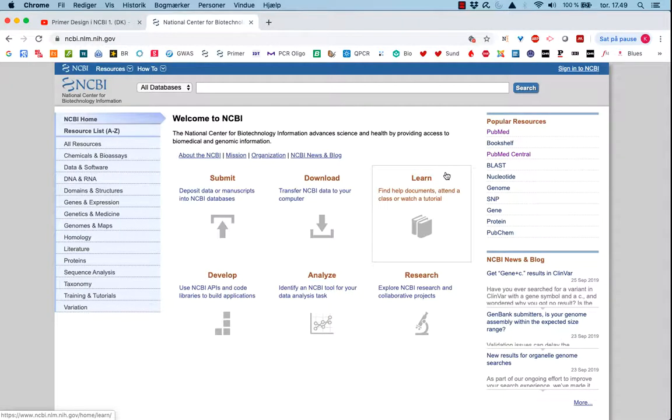Hi, this presentation, or this video, is about how to find primers using the National Center for Biotechnology Information, NCBI, and their web pages. This is the leading place if you want to find any DNA sequence. And the first step when you want to design primers is to find some DNA. This is the opening page.